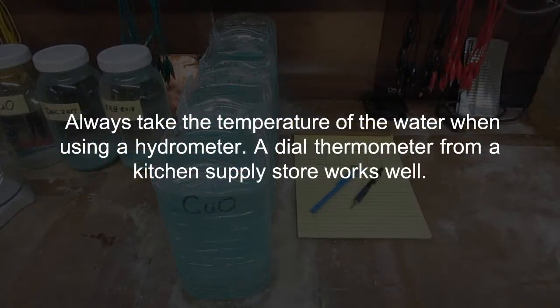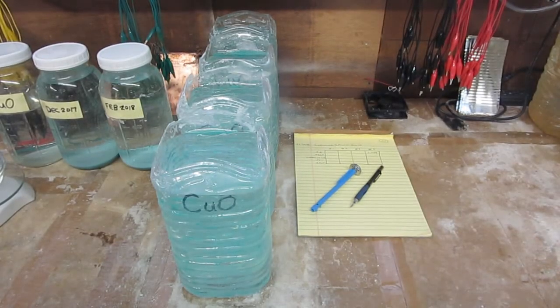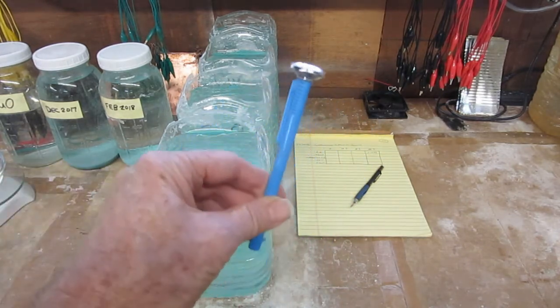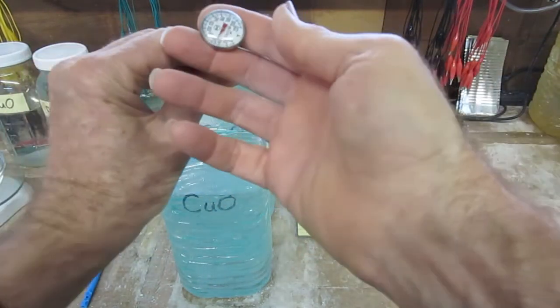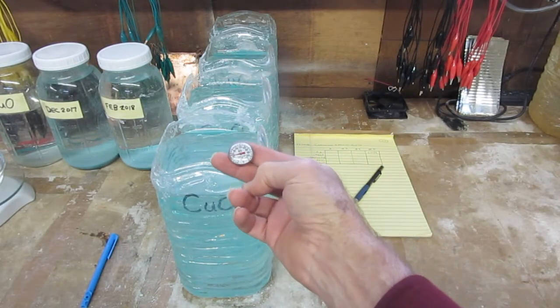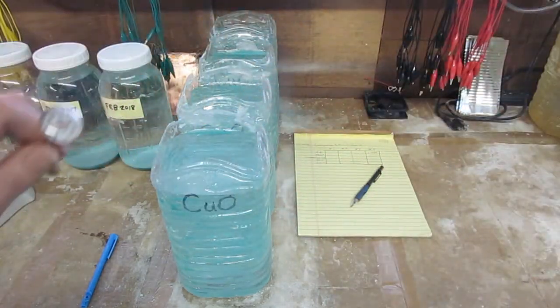Always take the temperature of the water when using a hydrometer. A dial thermometer from a kitchen supply store works well. Place the temperature probe into the water and hold it until the temperature reading stabilizes. The water temperature was 50 degrees Fahrenheit.